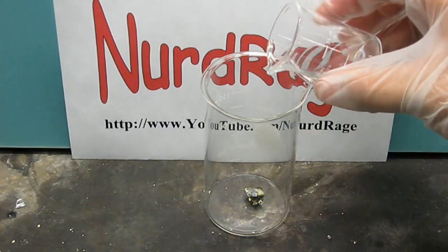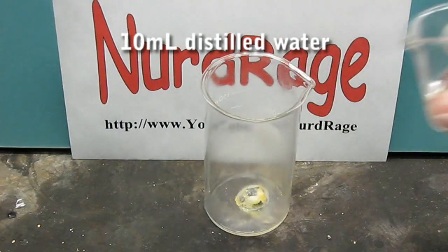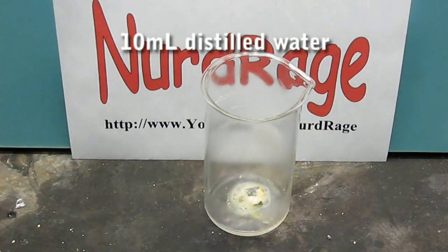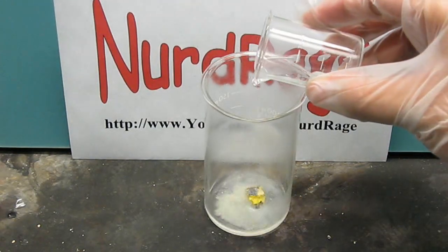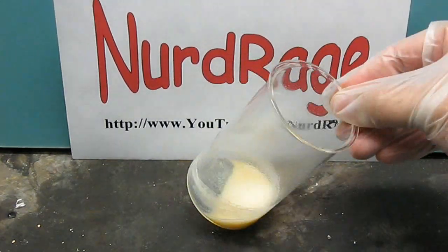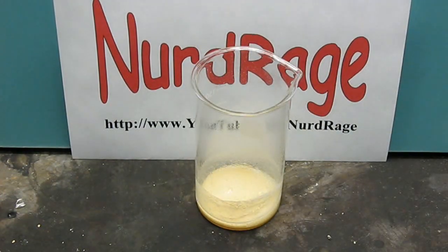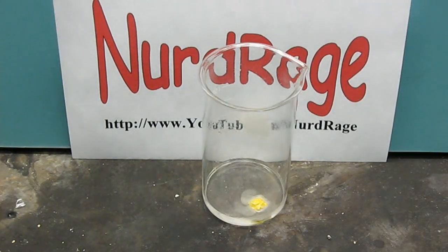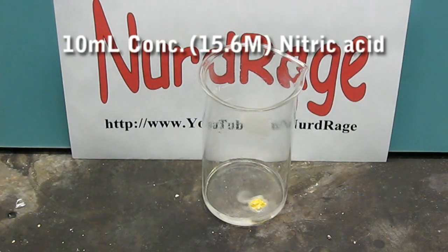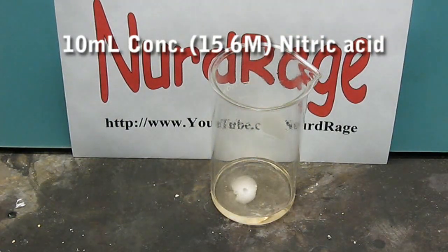Now carefully pour in a total of 10 milliliters of pure distilled water. As you can see, europium metal is pretty reactive toward water, about the same level as calcium. As it reacts it produces europium hydroxide that covers the metal and slows down the reaction. When the reaction seems to have stopped, carefully add in a total of 10 milliliters of concentrated 15.6 molar nitric acid in small portions.